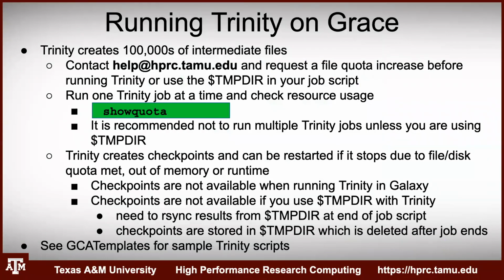All right, so running Trinity on Grace, like I mentioned earlier, it's one of those that uses tons of intermediate files. So you will either need to get a quota increase for your account, or use a temporary directory to write all those files to.